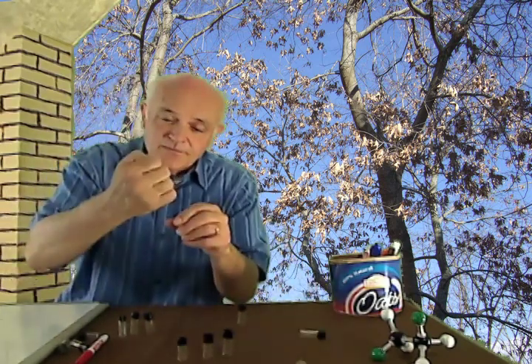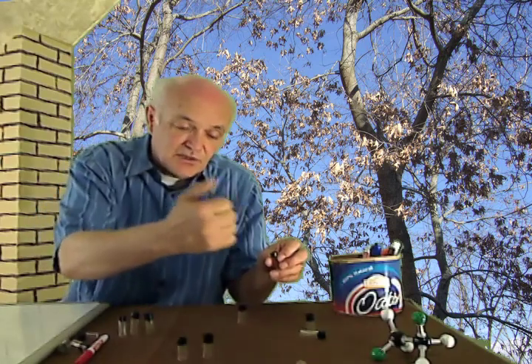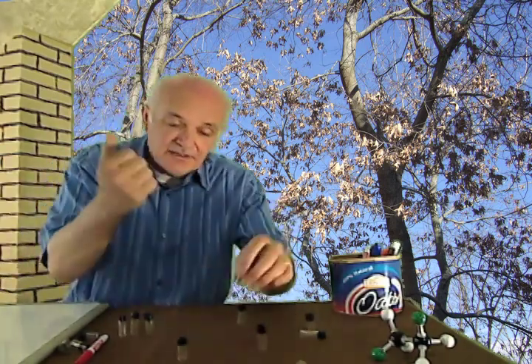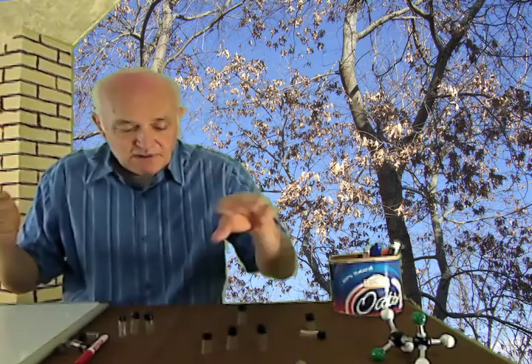Take the second one. Take up 5 microliters. Add it. Go through the series of rinses. Take the next one. Add it. Go through the series of rinses. Take the next one. Add it. Go through the series of rinses. Take the last one. Add it. Go through the series of rinses. Okay, so this one's done.